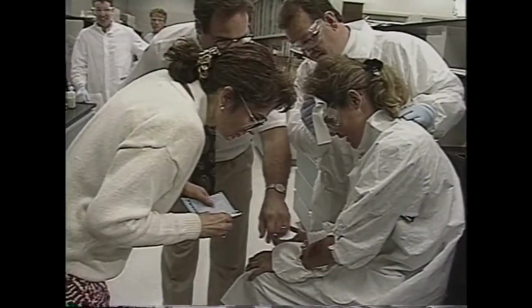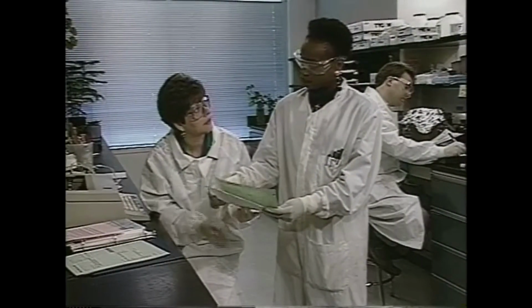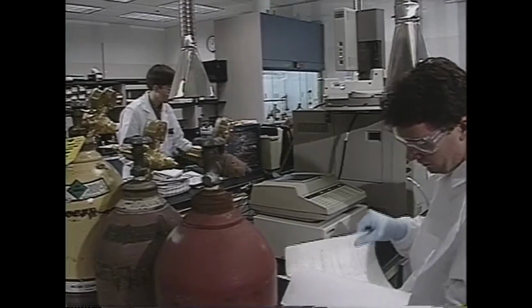If you think you've been exposed to a hazardous chemical, don't take any chances. Consult a physician immediately. If you have questions, ask your supervisor or your chemical hygiene officer. Remember, the laboratory is no place to hazard a guess about safety.